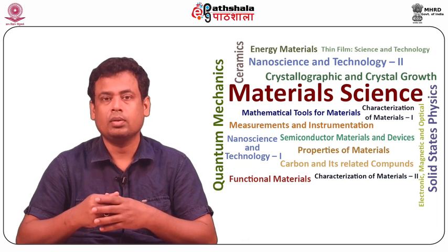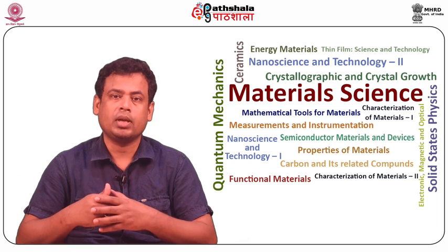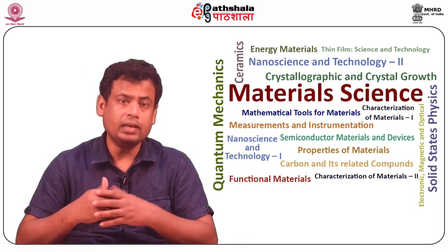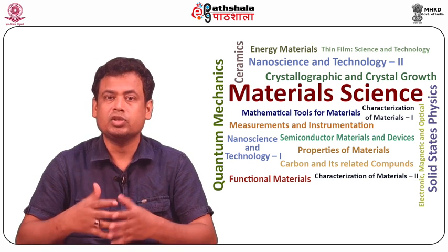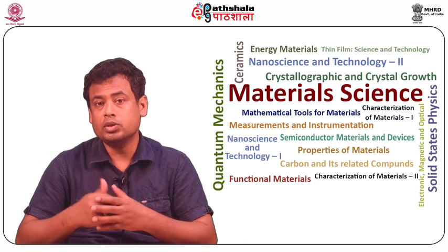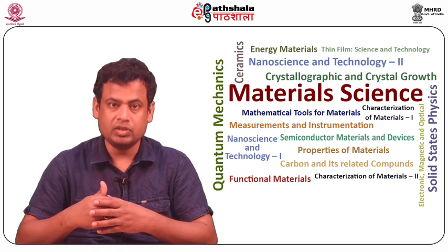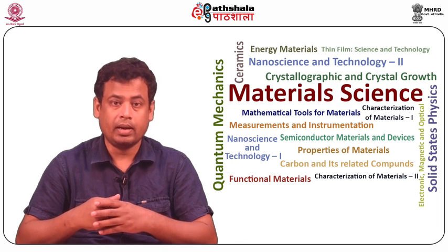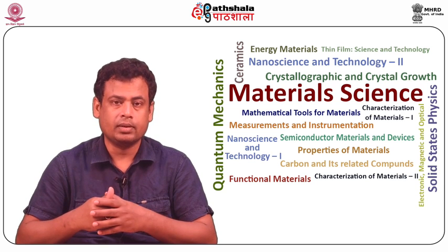The second method is to collect the signals with use of systems employed in the transmission electron microscopy or scanning electron microscopy, where initially the sample is immersed in the lens field, with the low energy electrons spiraling up the field lines through the hole in the upper pole piece and finally being collected by a small transverse electric field.